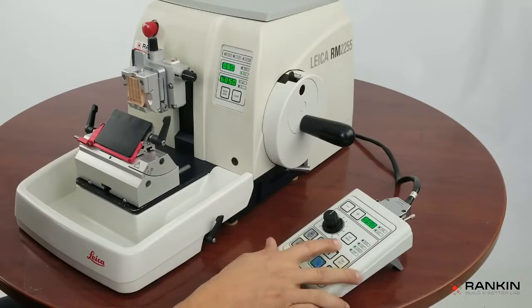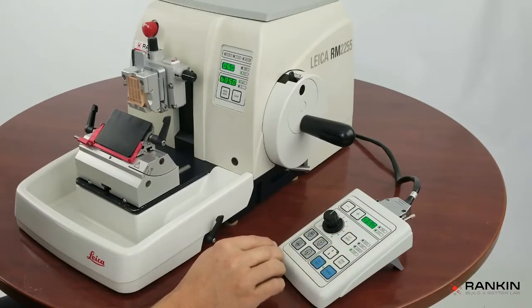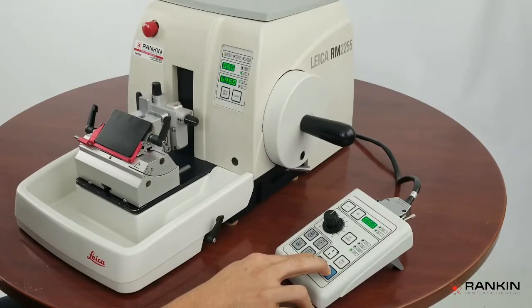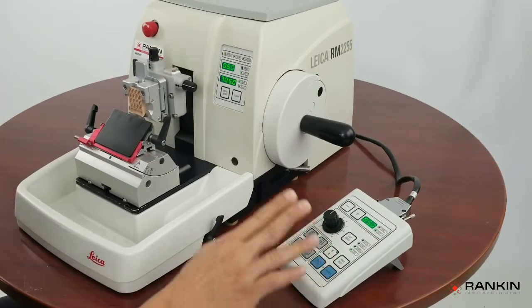The next cutting mode is the step mode. I don't see many techs using this, but basically the handwheel will run as long as you have the run stop button and the enable button pressed. So as long as I'm pressing and holding this, it's going to run, and then as soon as I let go of the enable button, it's going to stop.